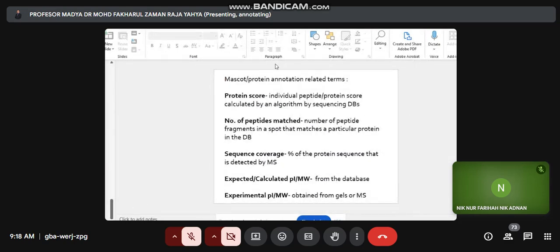These are several parameters that we can change. If we do not want to make any changes, we can use the default parameters, as I mentioned just now.